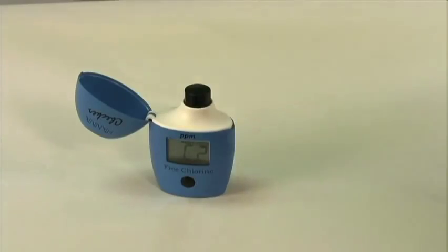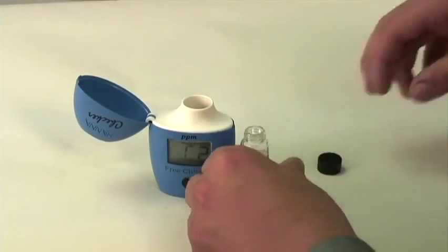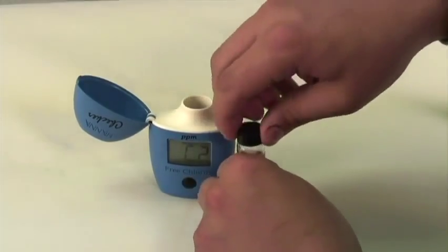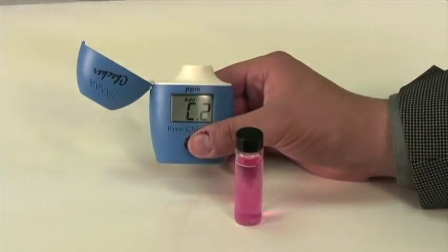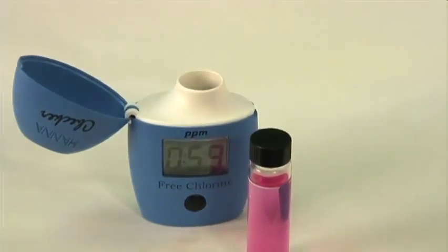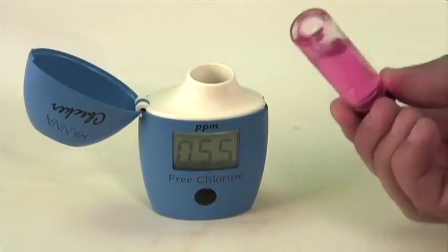Now, having opened the meter, we remove our cuvette and add in our DPD reagent. One of the most interesting features of the checker is that we actually have a timer, which you access by pressing and holding the button for three seconds. This timer begins a countdown for the reaction with our free chlorine.